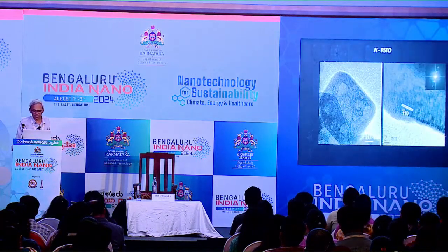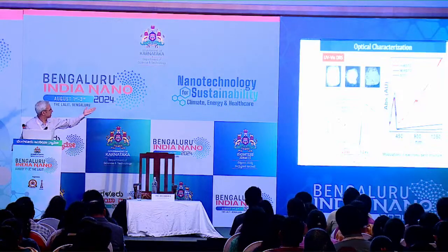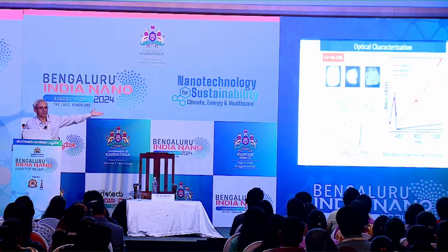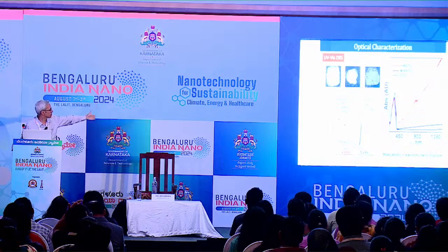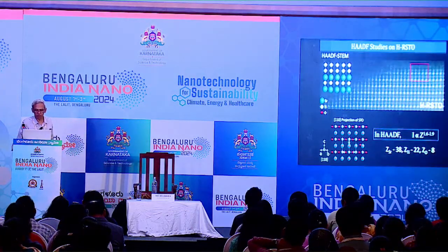I think the slides are going to be shared with you possibly, so you can have a look at that later. Of course, as it gets reduced, it becomes darker grayish in color. It absorbs light over a wide range, with implications for properties and so on. Never mind the details. Again, we use STEM mode.